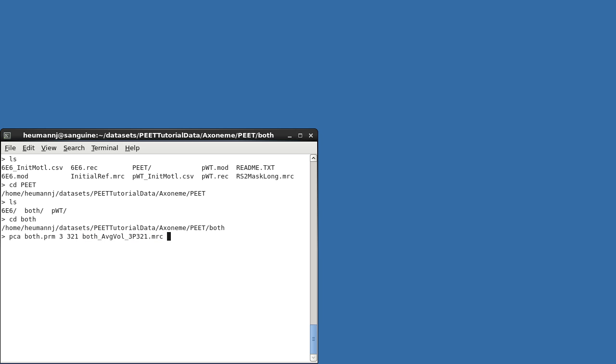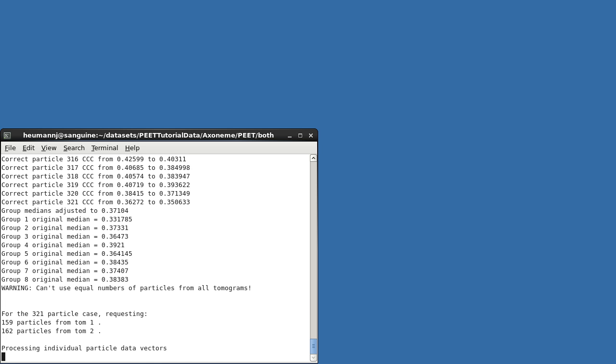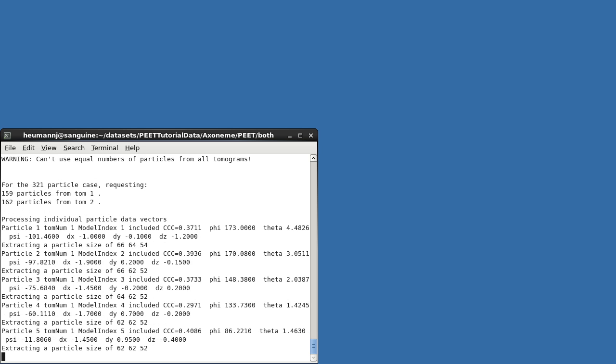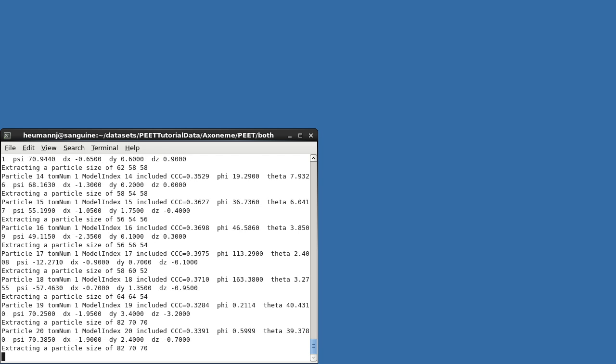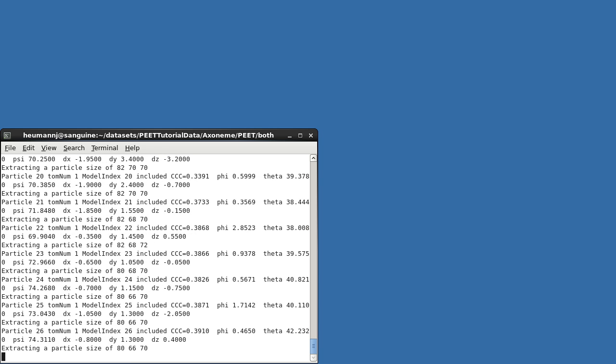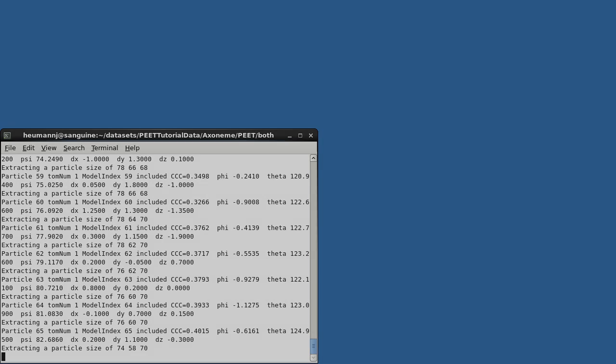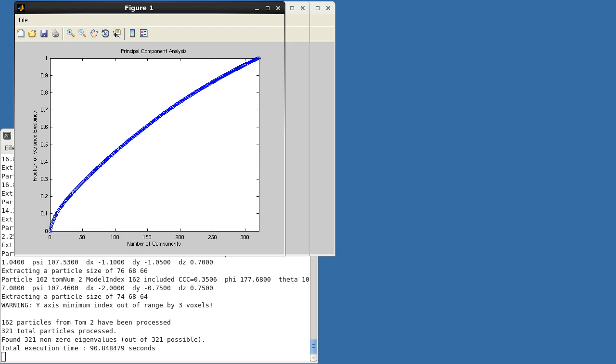Typically, this will be an average created with the same number of particles as are being analyzed. The PCA program is compute and memory intensive and should be run on a fast computer with large amount of memory. Roughly 32 GB of memory are recommended for 600 particles of size 140 voxels cubed. Binning, selection of a central sub-volume of interest, or single precision computation can be used to reduce memory requirements for large datasets.